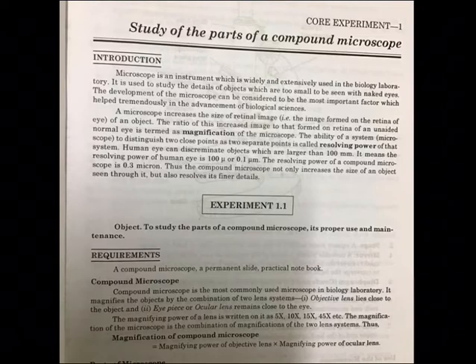The development of the microscope can be considered the most important factor which helped tremendously in the advancement of biological sciences. A microscope increases the size of the retinal image, the image formed on the retina of the eye of an object. The ratio of this increased image to that formed on the retina of an unaided normal eye is termed the magnification of the microscope.